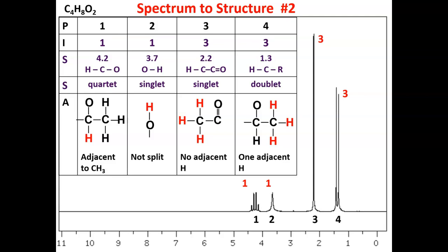And because it's 3 H's on that carbon, that must be the end of the molecule. And also in peak 4, we've got just a single H bonded, as you can see, to a C with an oxygen. And unsurprisingly, we've got here a terminal methyl group, a carbon with 3 H's. And you can probably tell why we have the doublet as well, because there is a single H only bonded to the carbon with the 3 hydrogens. So the methyl group has a C with an H and a single bond O on it.